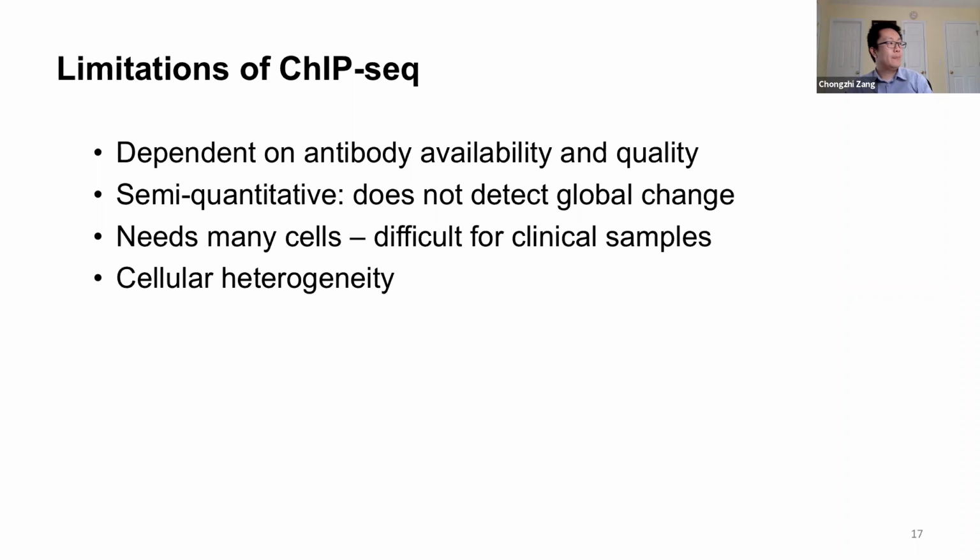I think these are all the online resources and tools that I want to cover for the lecture today. In the end, I want to mention several limitations of a ChIP-seq experiment that we always want to keep in mind, whether doing a study design, doing the ChIP-seq experiment, or analyzing the ChIP-seq data. ChIP-seq is highly dependent on the availability and quality of the antibody used in the experiment.